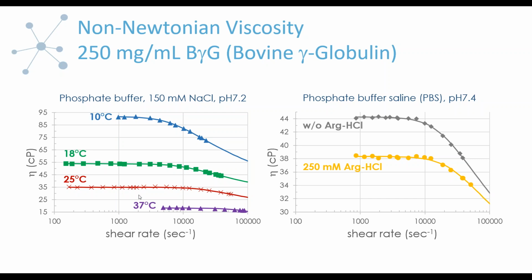This is the most common response of viscosity to temperature variation. Now there are exceptions to this, and we presented those in other webinars, but unless you have some sort of complicated self-assembly that is dependent on temperature, you won't see any vast deviations from Arrhenius behavior, but that's, again, a separate topic.